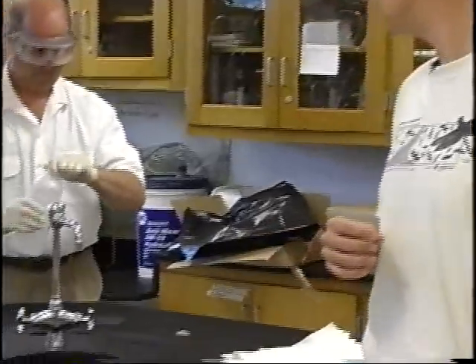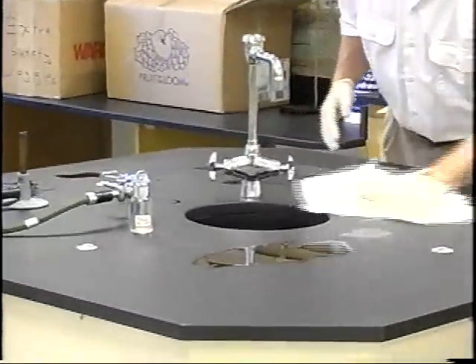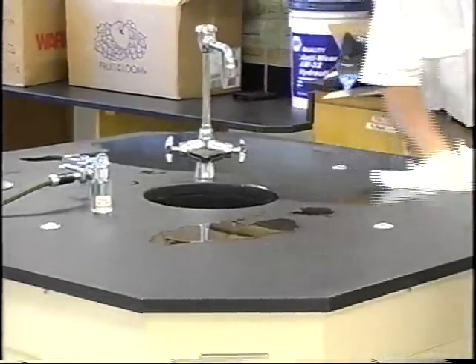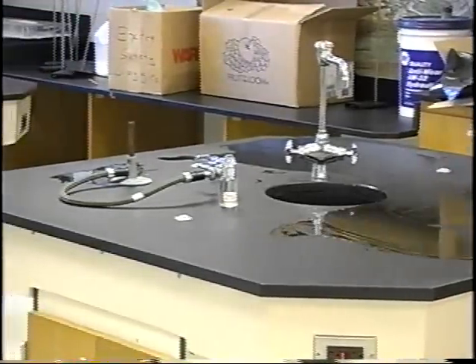So what he's going to do is simply pour alcohol on the table, get some paper towels, and thoroughly saturate the entire work area with alcohol. By doing this, any other bacteria that's in the area has been completely wiped out.